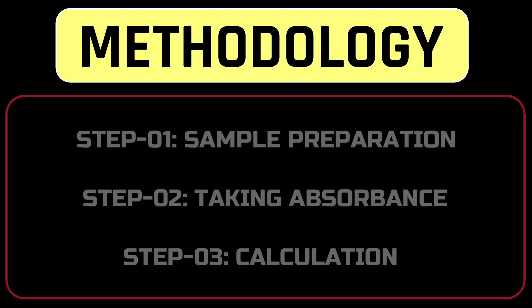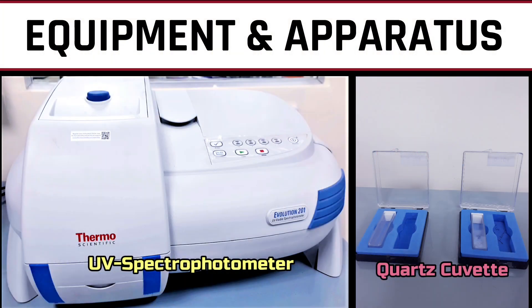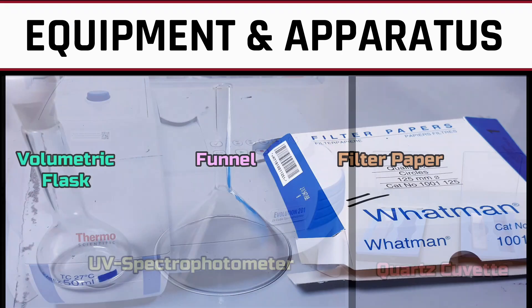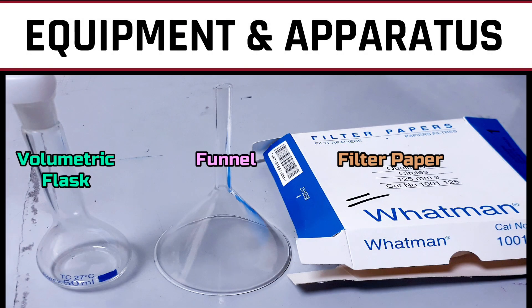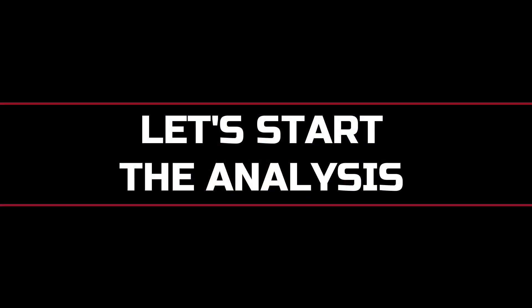To conduct the experiment we need a balance, vortex mixer, UV spectrophotometer, quartz cuvette, volumetric flask, funnel, Whatman filter paper, and n-heptane. Let's start the analysis.